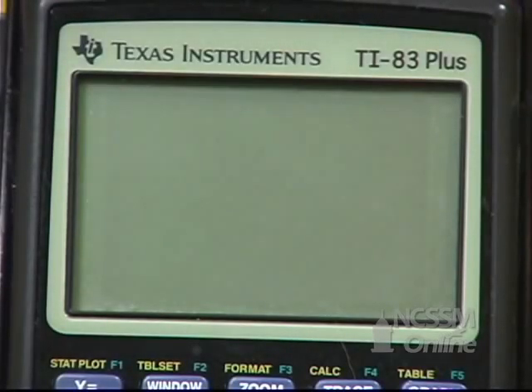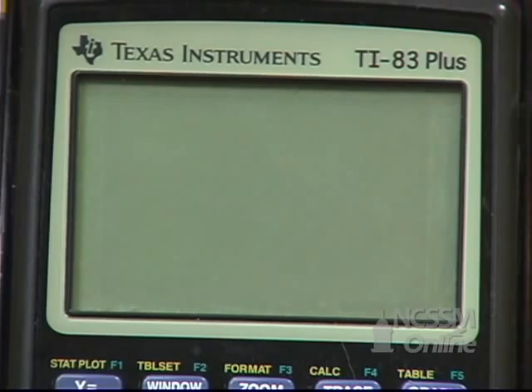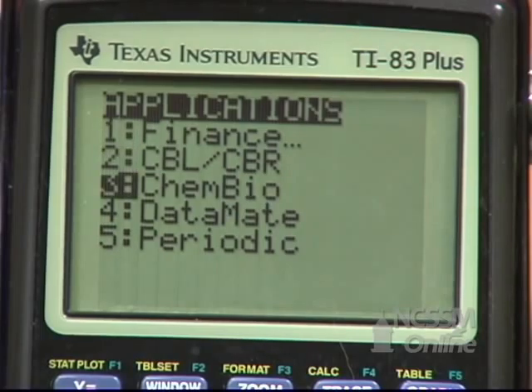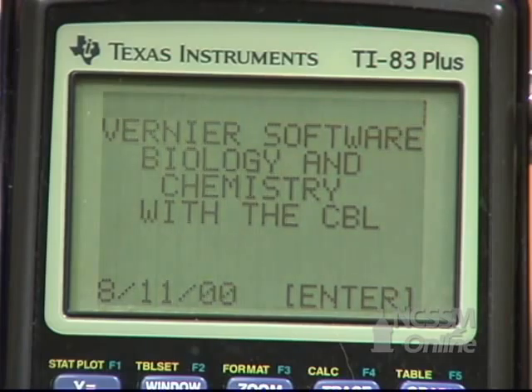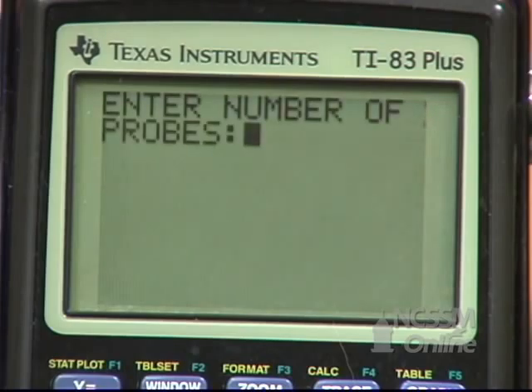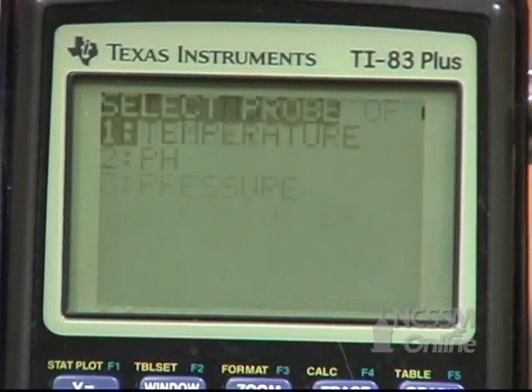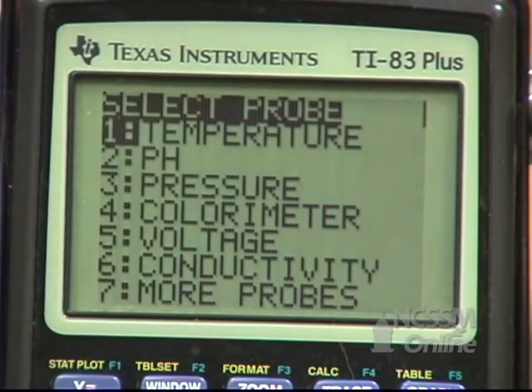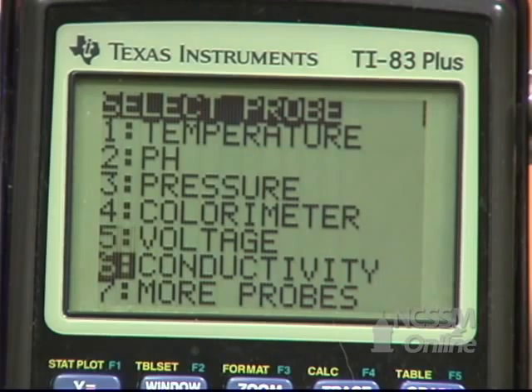We're going to calibrate a CBL conductivity probe. To start out, press Apps on your calculator. Select Cambio and press Enter. Go to Set Up Probes, set the number of probes to one, and for the type of probe, select Conductivity.